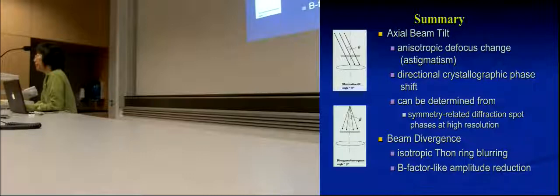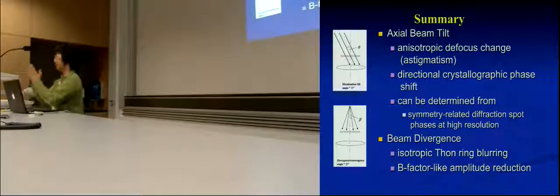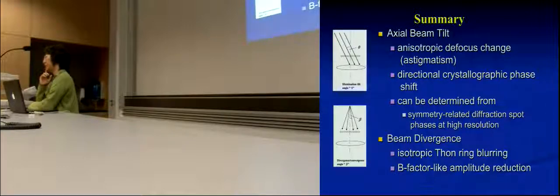So you talked about the divergence, right? Mm-hmm. And the effect that it dampens the amplitude. Right. But you haven't said that there's any connection. So could you just determine the dampening? You probably can, but let's say I have 1 milliradian of this. The structure in the beam that has 1 milliradian of beam tilt will reach where it goes to 0 earlier than the beam that's inside. So it's a bit harder to do that correction now that we already do the average.